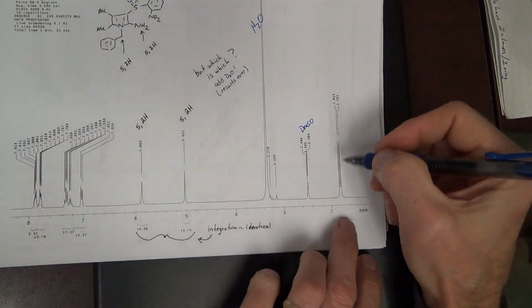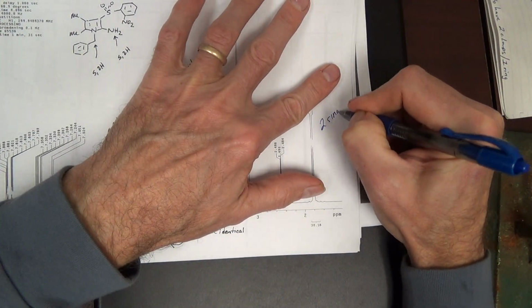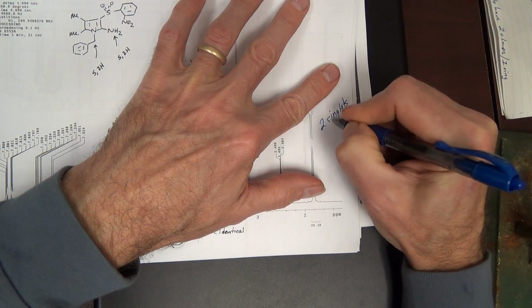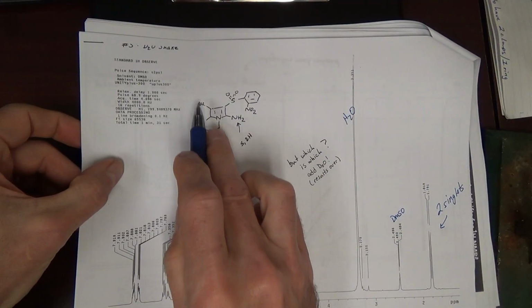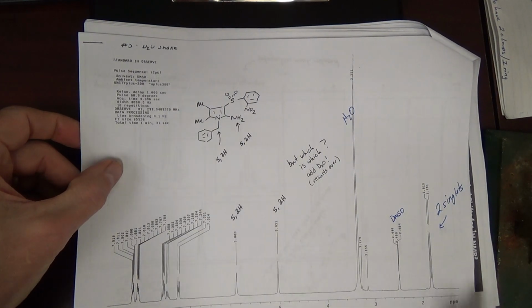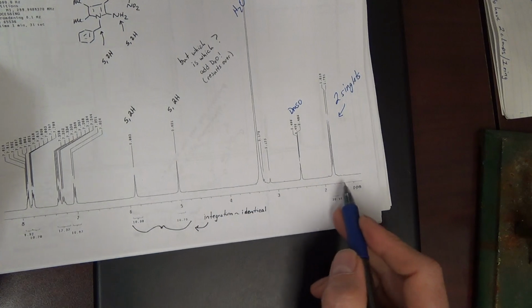Aromatics. This looks like a doublet here. It's actually 2 singlets. That's the 2 methyl groups. They're not equivalent. Each one gives a singlet. Sort of down in the 1 to 2 range.